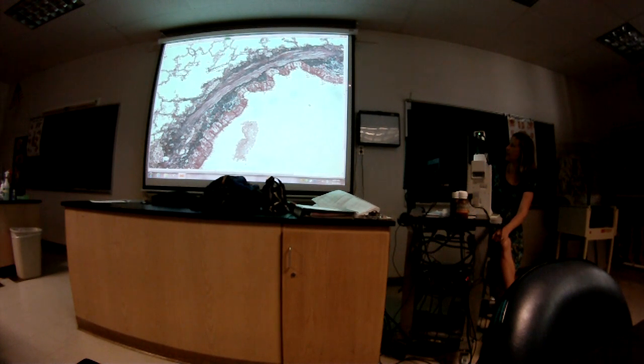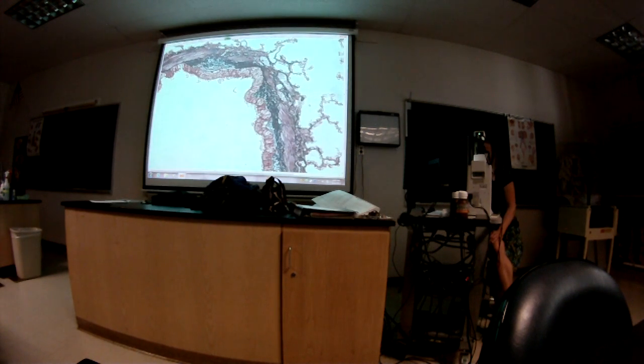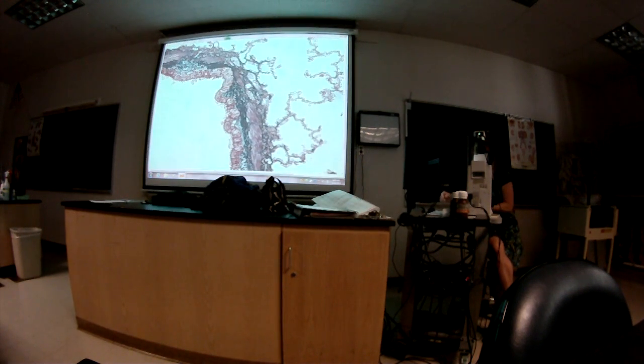This is the epithelium. And with the epithelium, you have to be careful because it's got a lot of mucus and stuff on it. I know it almost looks like cilia, but it doesn't. Some of them look like simple cuboidal and some of them not so much. So the better bet is to look for the cartilage. But no, that's not cartilage. Maybe when we look at the next one, it'll become more clear.